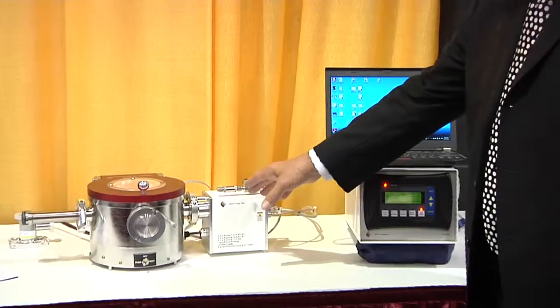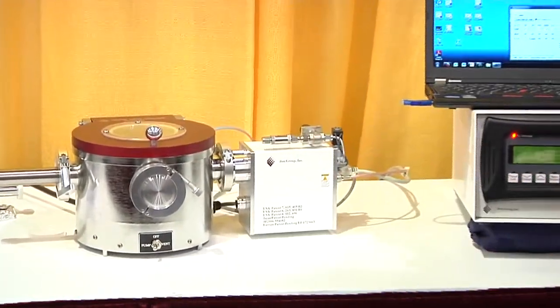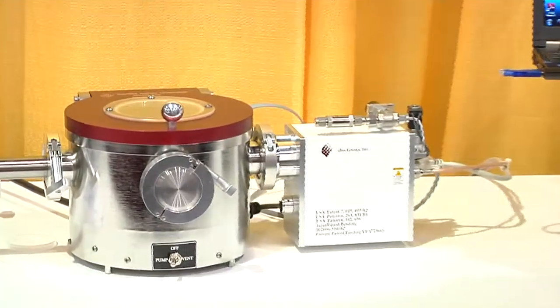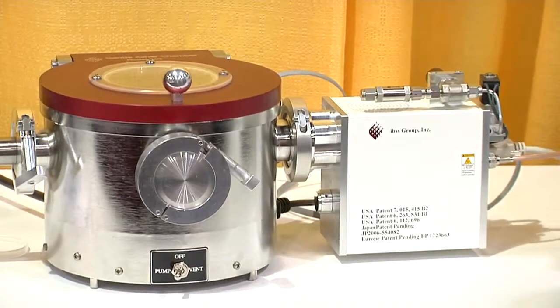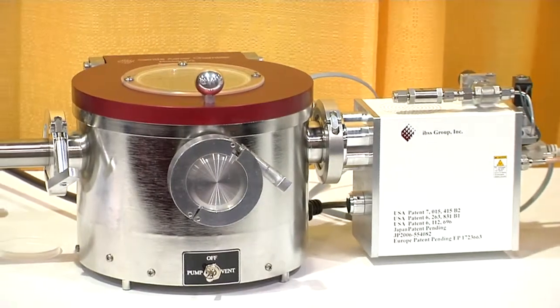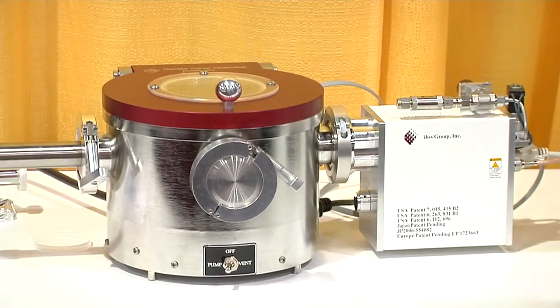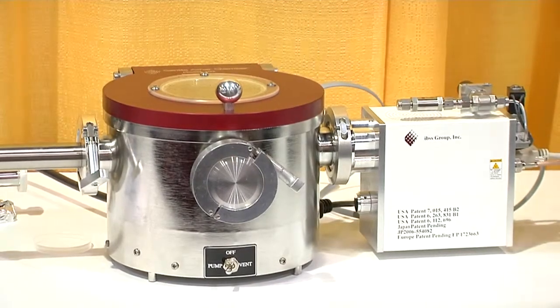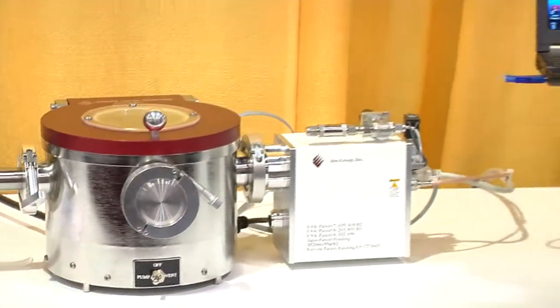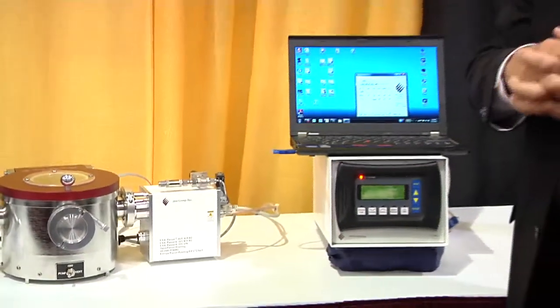The source is a downstream source, and it operates with a very broad operating pressure range from 2 torr down to 5 times 10 to the minus 3 torr. This broad operating range allows you to clean your chamber and your samples very quickly and return to the operating pressure in the SEM in approximately 2 minutes.